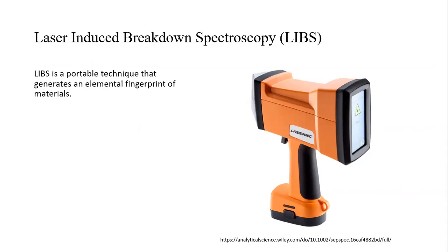There are other techniques that could have been utilized, but they are much bigger than the handheld spectrometer, like shown in the image. And so using the spectrometer allows us to bring the instrument to the sample using LIBS in order to keep the samples in the original place and not move them to a special medium. In this case, our samples are very heavy metals called actinides.